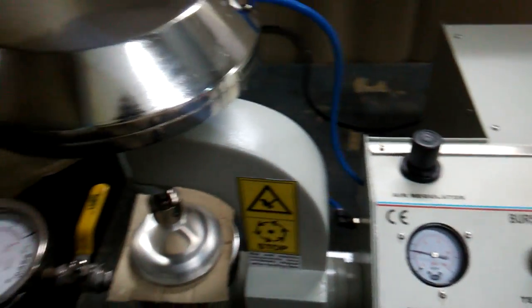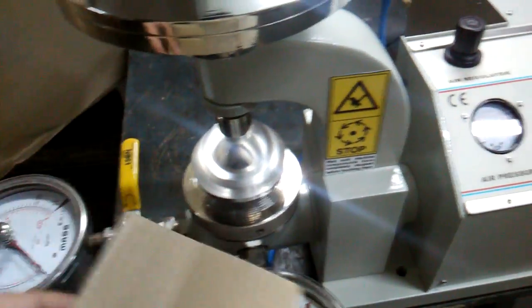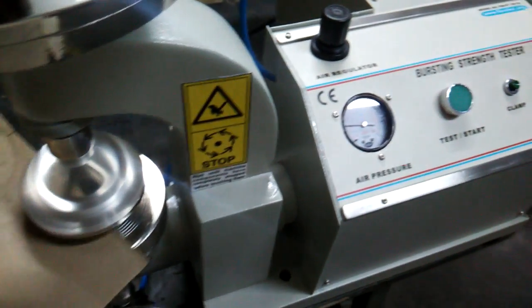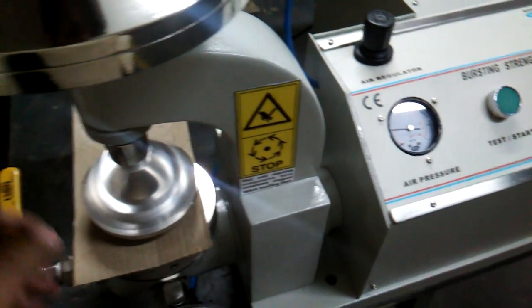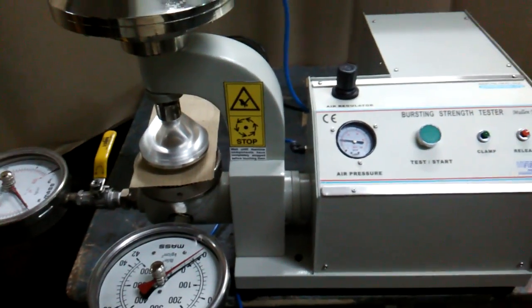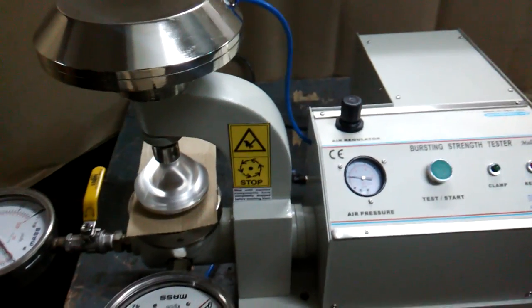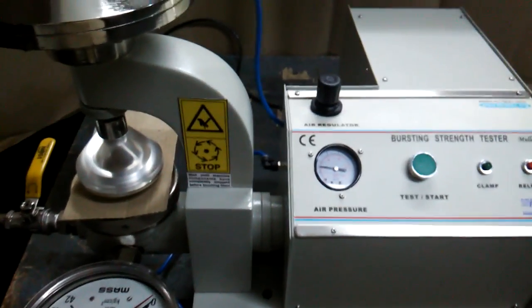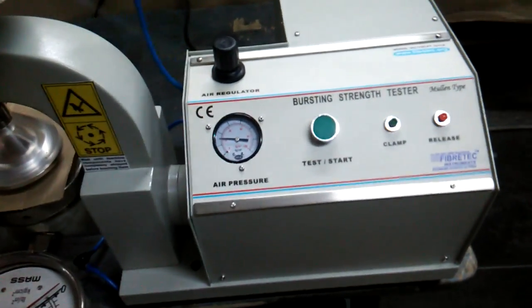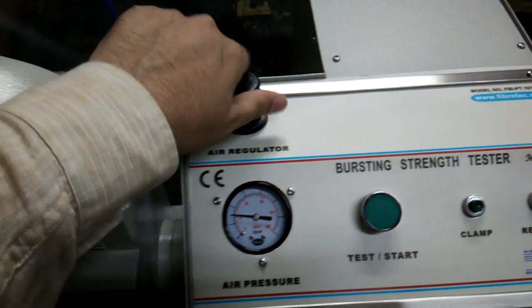This is the specimen we have. You can cut the specimen in the desired size as per TAPPI or ISO standards and make the specimens accordingly. You can place the specimen over there and control the pressure over here.